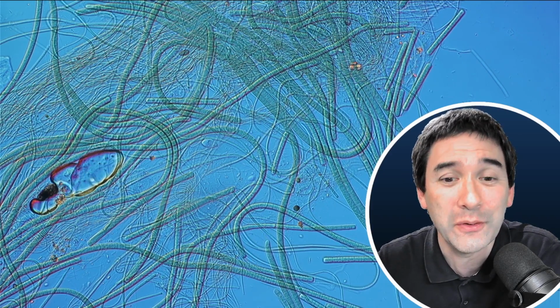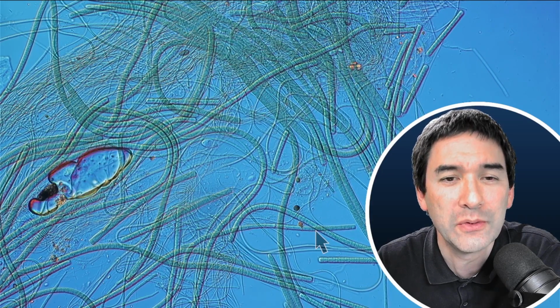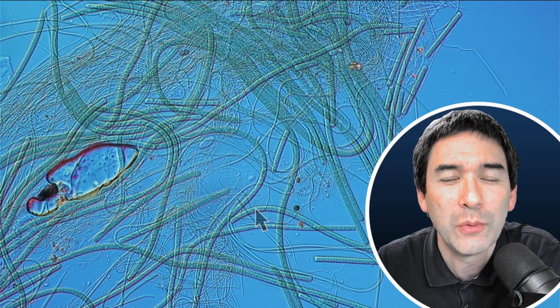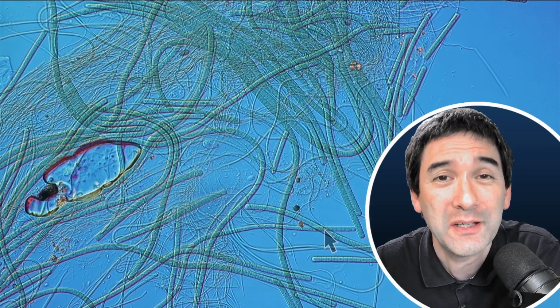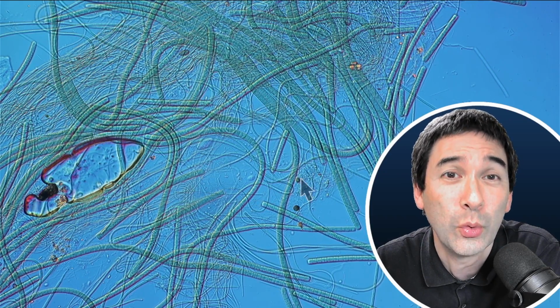So if you look very carefully, and I need to again switch on the arrow over here, then you're able to see that each one of those filaments is subdivided into smaller cells. So these are actually colonies of multiple cyanobacteria here. What is interesting is that some of those filaments actually move in a quite coordinated manner.